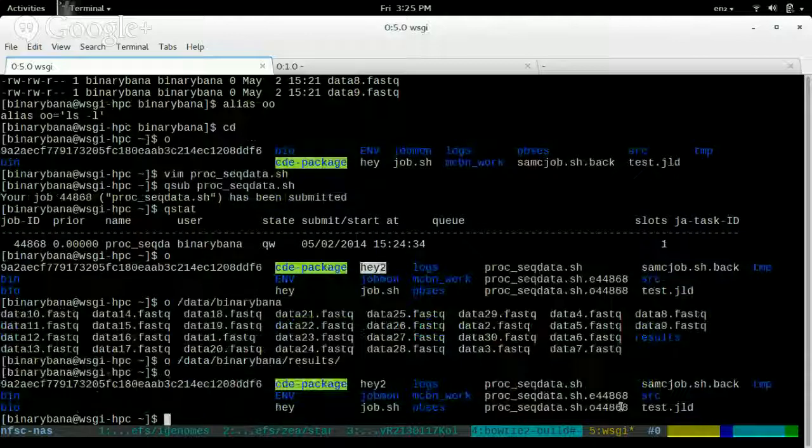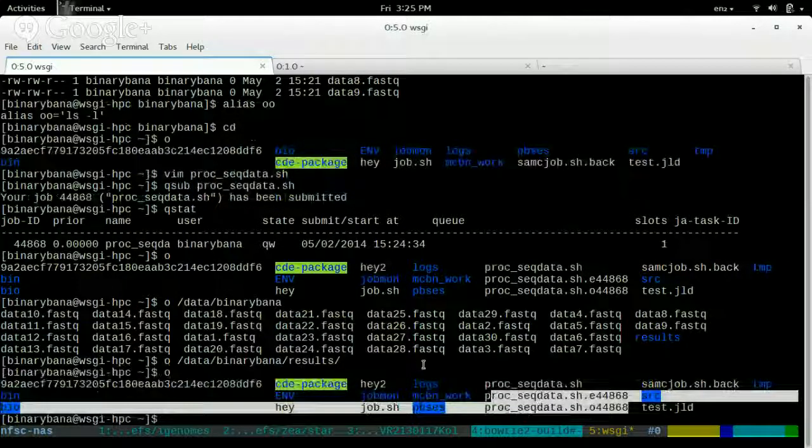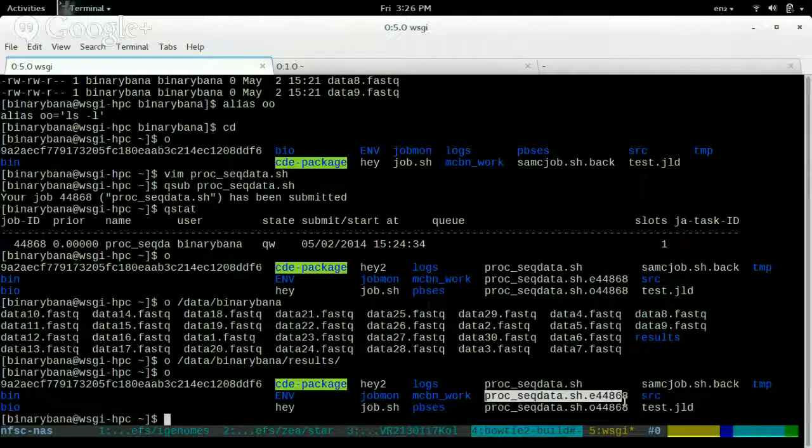And right here you can see that you can't see the output. Do you need to answer the phone? No, we're good. Okay. So when you qsub something, you can't see what happened, right? Because it went and ran on some other computer. Heck, it might not run until tomorrow because the system might be bogged down, and so we're not scheduled to run until tomorrow.